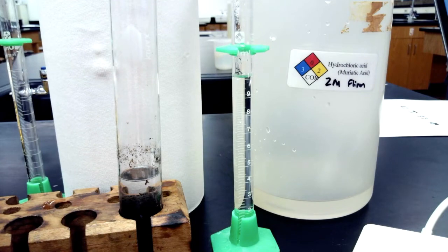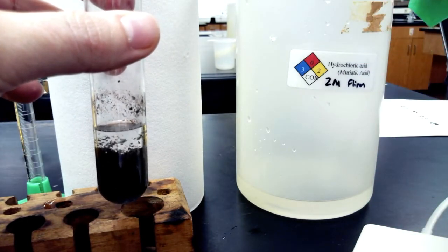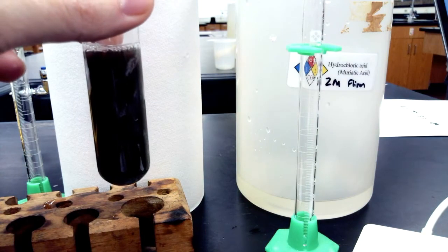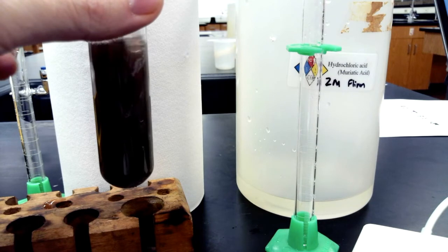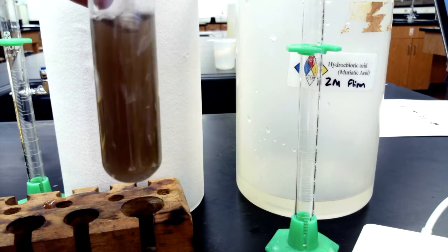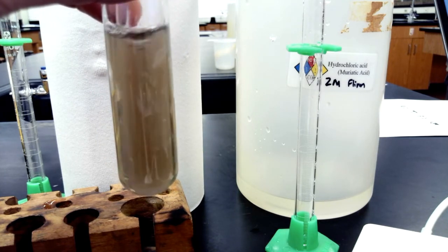Then step 5 is to add hydrochloric acid. You see the bottle of hydrochloric acid. It's measured out in a graduated cylinder. Then when you mix it and stir it, you'll see what happens. You can see the precipitate is starting to dissolve.